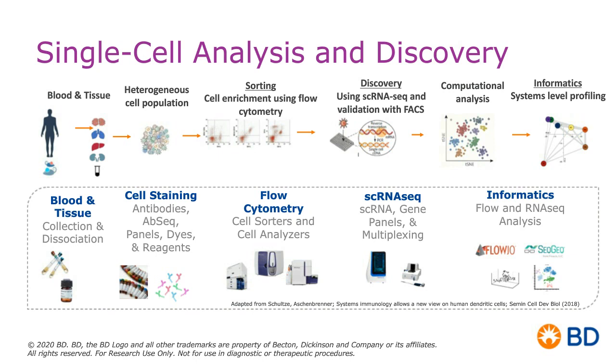However, as technologies have evolved and things have progressed, we've basically moved into a new space where we're able to scale proteomics even further.